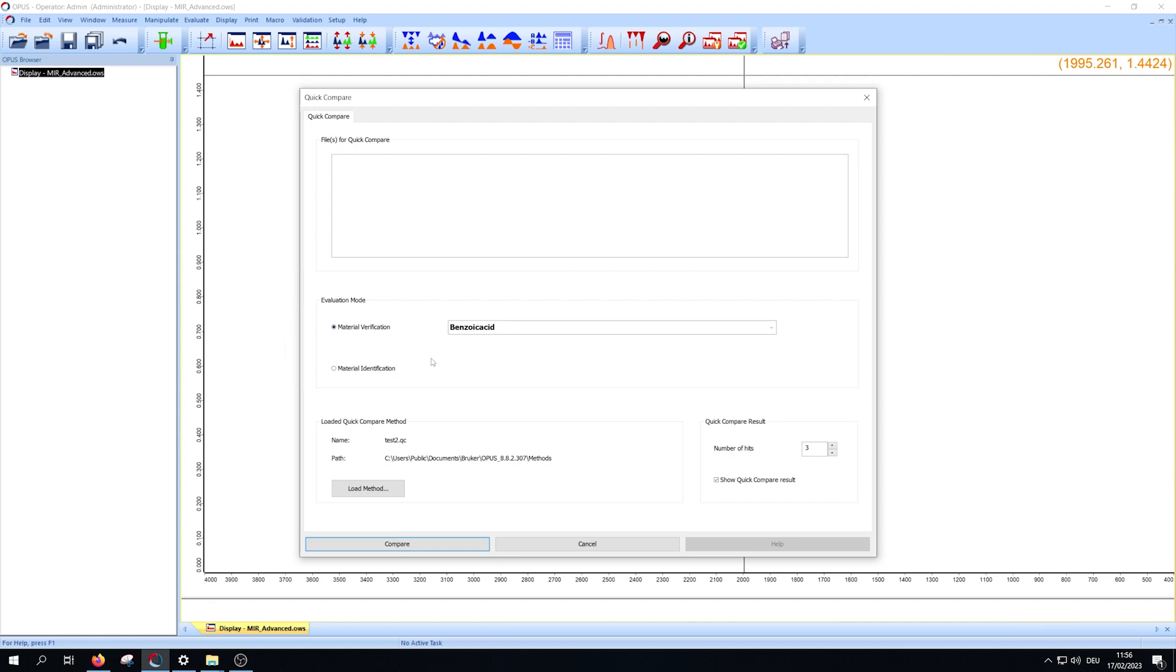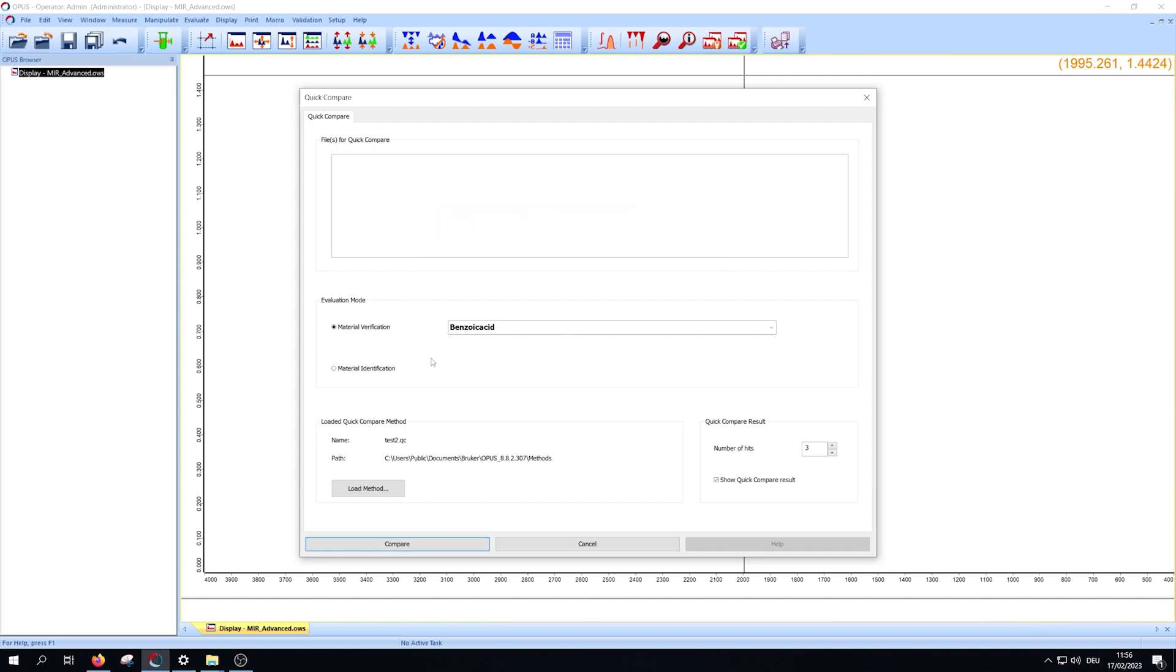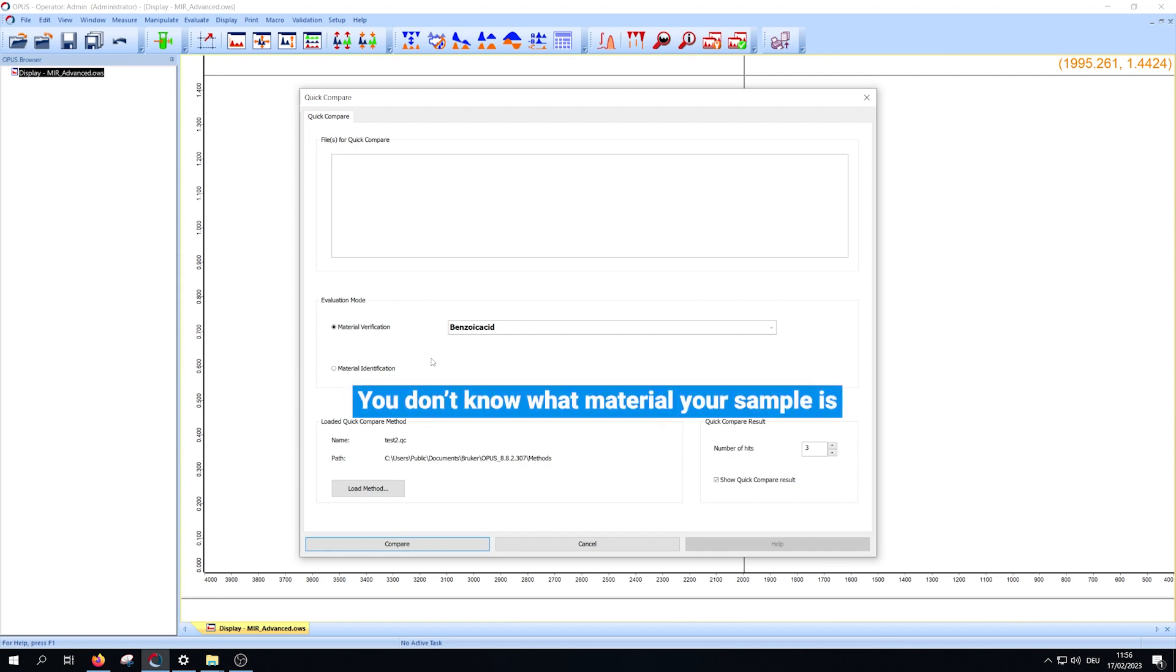Use verification if you want to verify that a sample is what it should be and that it has the required quality. Use identification if you don't know what material your sample is.